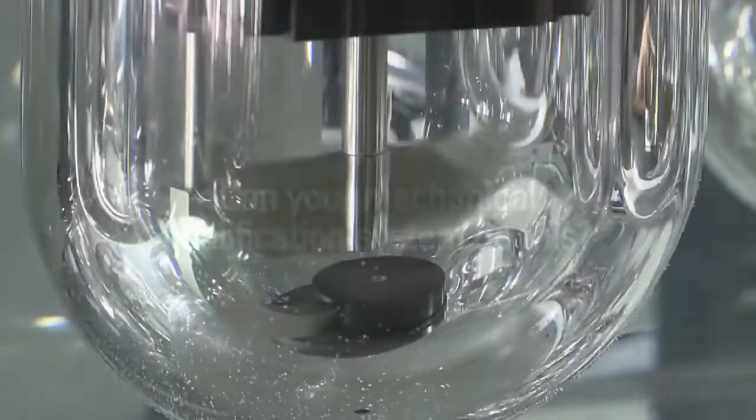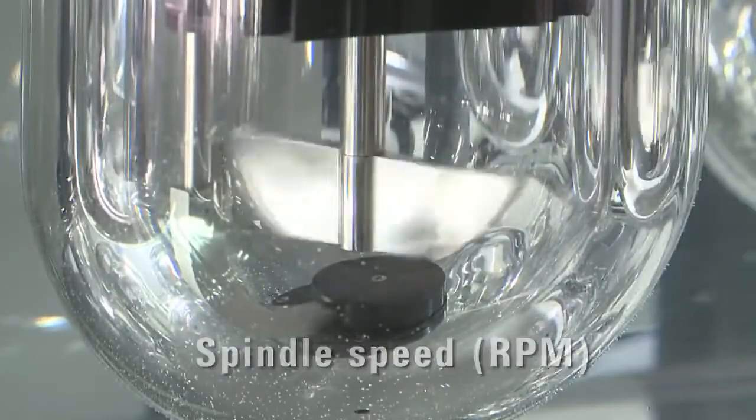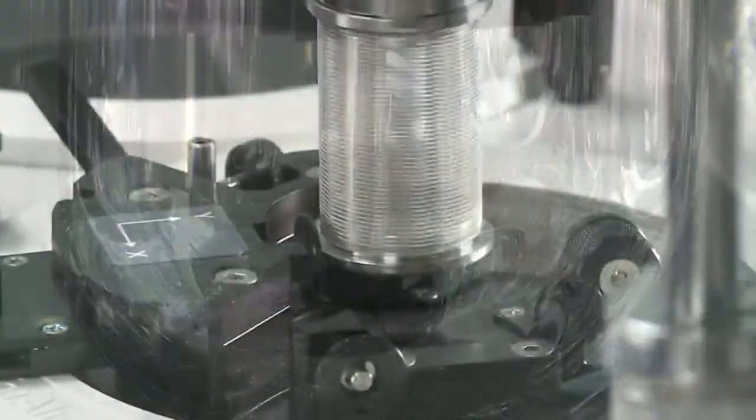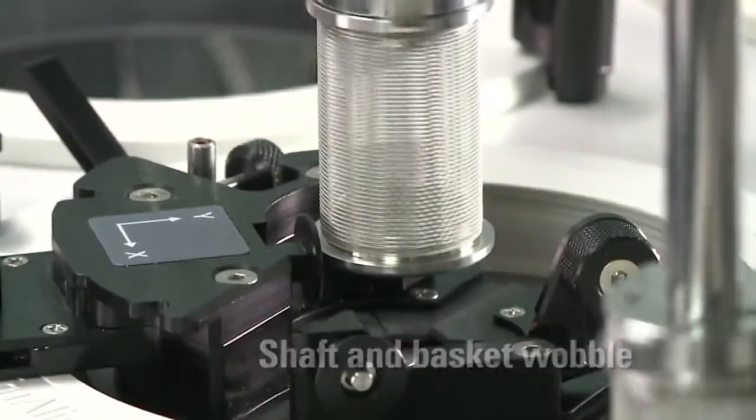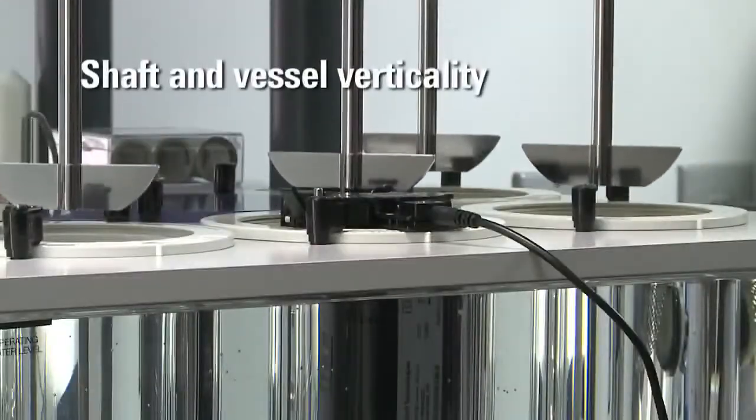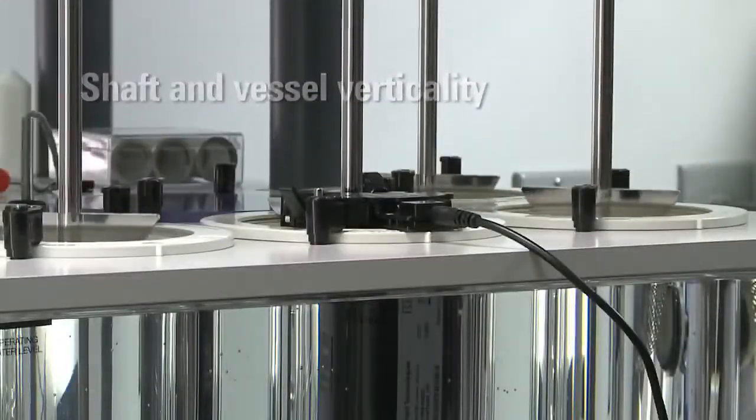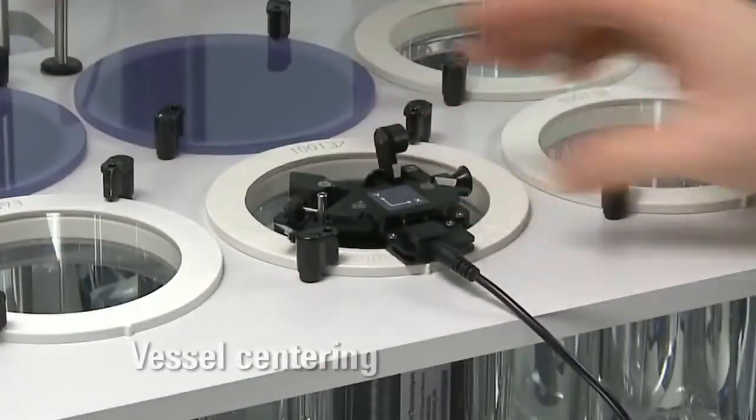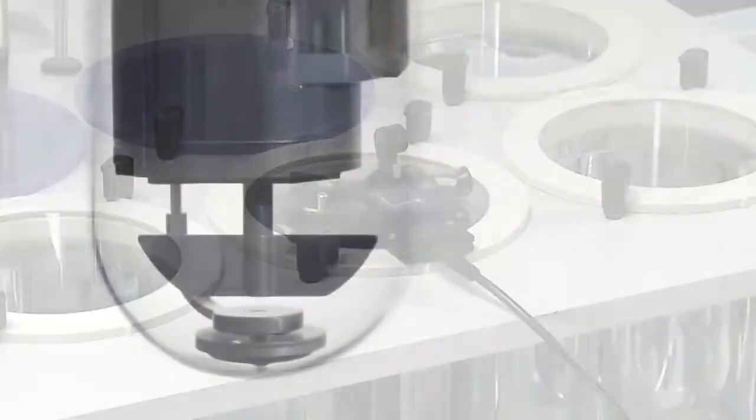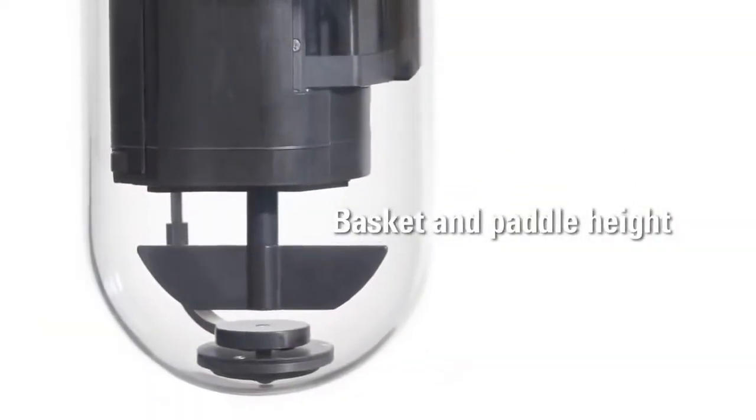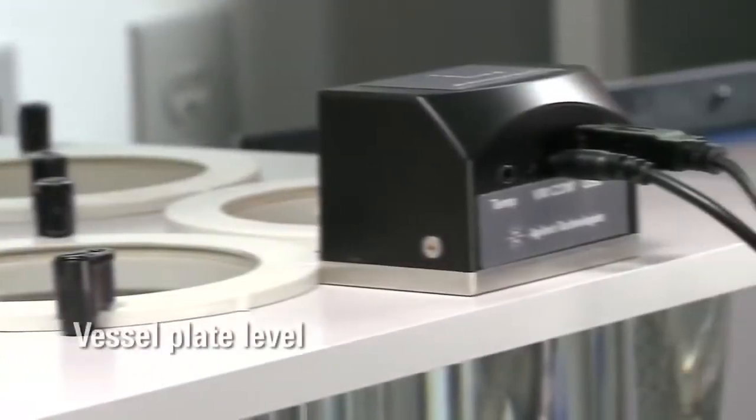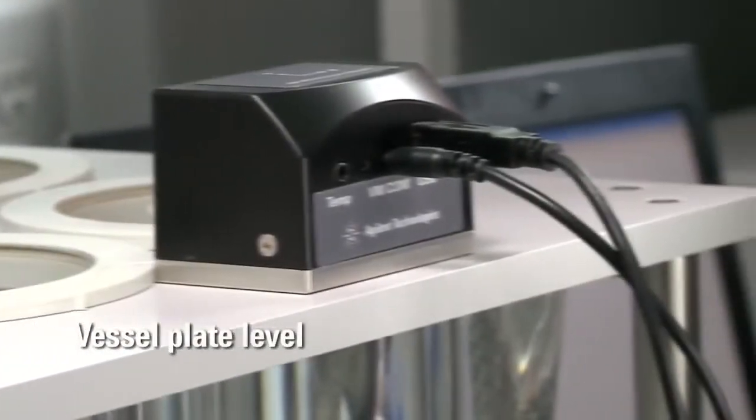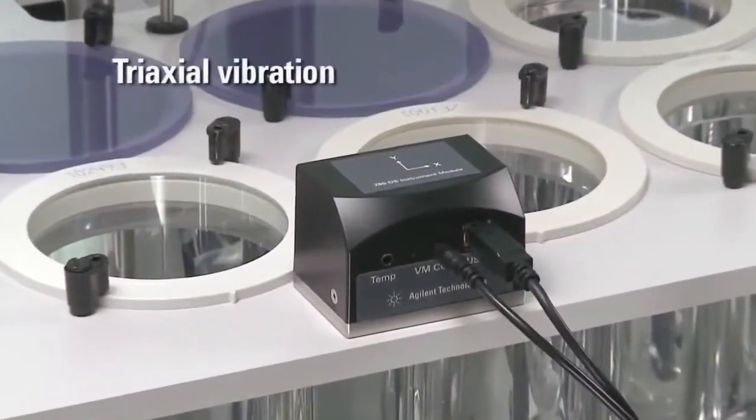Measurements include spindle speed, shaft and basket wobble, shaft and vessel verticality, vessel centering, basket and paddle height, vessel plate level, and triaxial vibration.